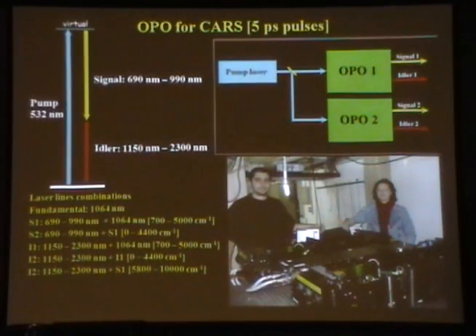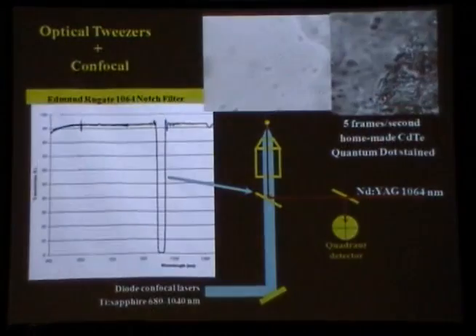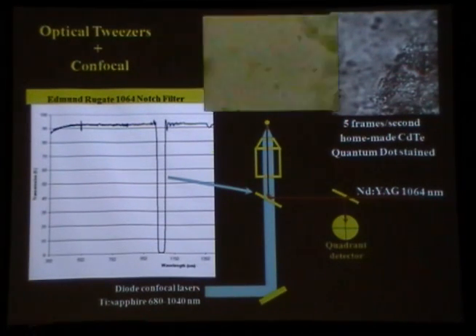Okay. So here are the pump lasers, and the output laser is going to come right at this spot here. For that, we have this kind of filter that will only reflect 1064. Everything from the Ti:Sapphire laser all the way to the visible laser is going to pass through. Even 1.5 microns is going to pass through.